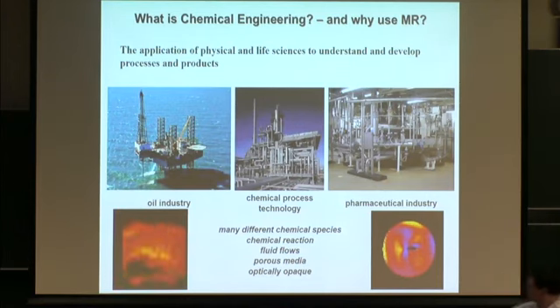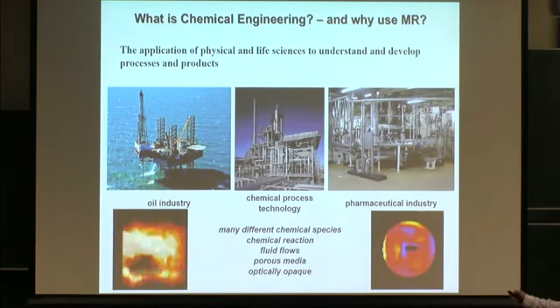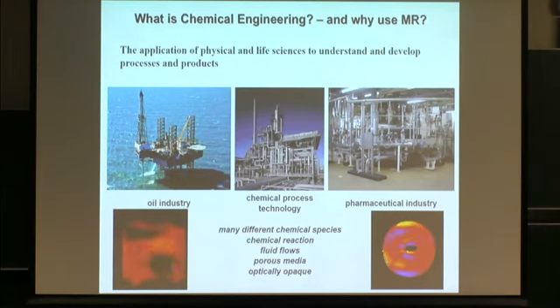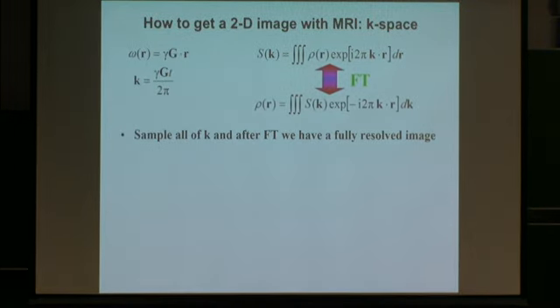I've just got a couple of examples. This is a fluidized bed which would be used for catalytic cracking of oils. This is an example of drug dissolution in a USP4 cell, looking at the time evolution of the structure of the tablet.